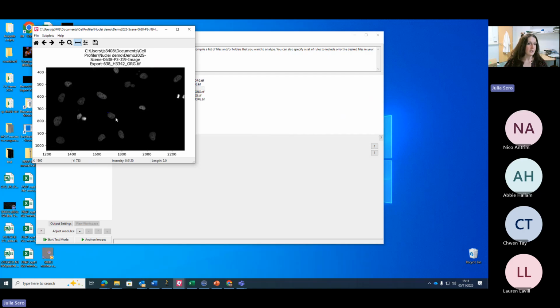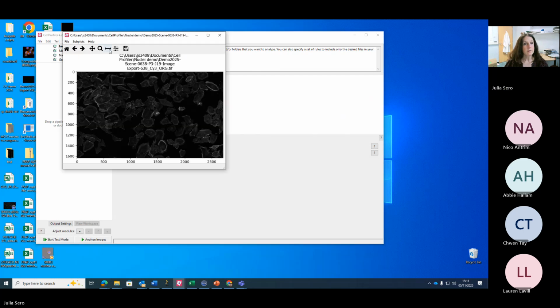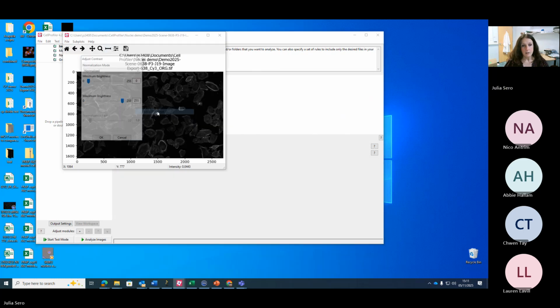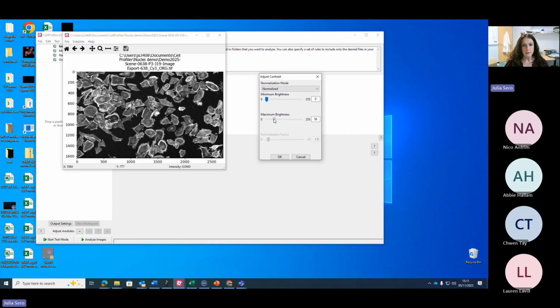This is very useful because when we start to ask CellProfiler to identify objects, we are going to need to tell it how big, roughly, the things are that it's looking for. Are they a few pixels wide? Are they 1,000 pixels wide? So this is giving us the length in pixels. We might look at another image, and see that this is a bit dimmer, but we can see a nice bright actin stain there.